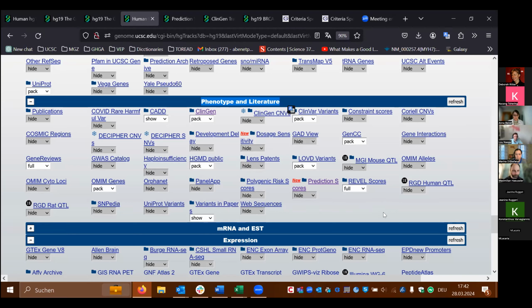A major thing the field in general needs is ready, quick access to multiple splice predictors. SpliceAI is one. Some others used, at least on the ClinGen side, are VarSeq. But again, I don't know how publicly accessible a lot of those are, not in terms of being able to go to an interface and use it, but in terms of getting that into the format needed to pull it into UCSC Genome to display it across multiple genes. So yeah, we can check that.